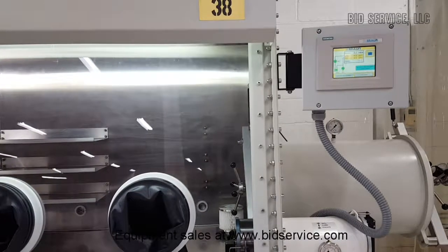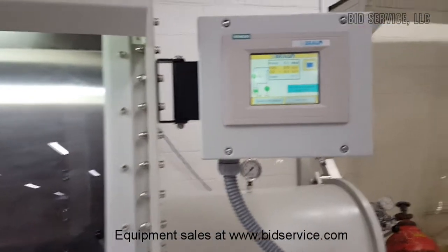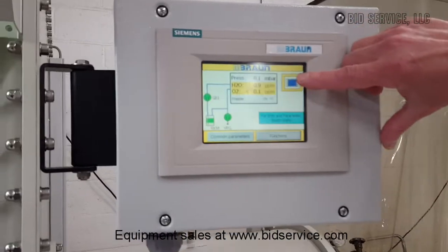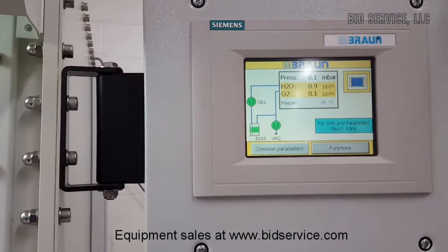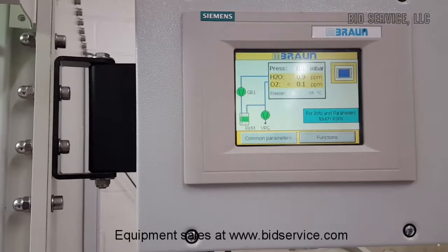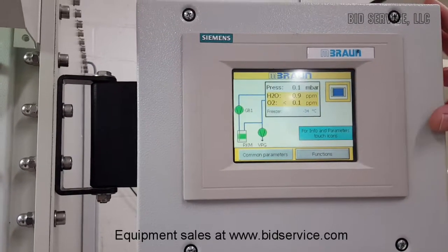This is the Embron Lambaster 130 glove box. Here's our operator panel interface, and you can see that we're at less than one parts per million of water vapor and less than 0.1 on oxygen. We have a pressure set at 0.1.